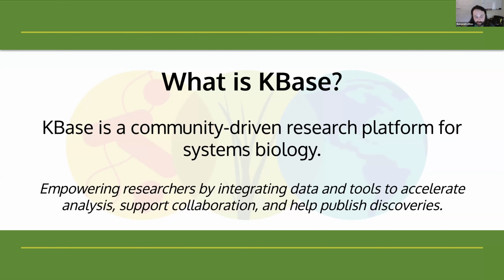And additionally, we want you to publish the results and data that you have generated on the platform. So we have some publishing features as well that we are excited to share with you all, and certainly excited when we see people integrating these into their publications.